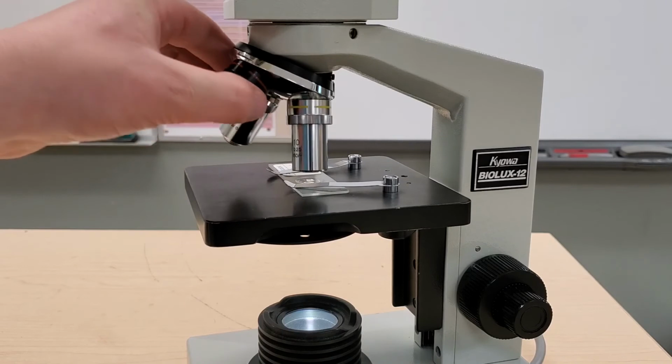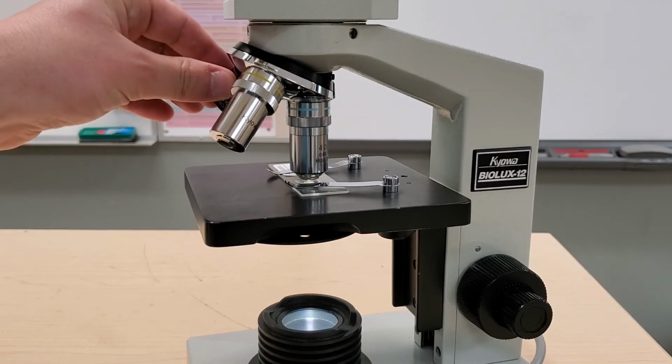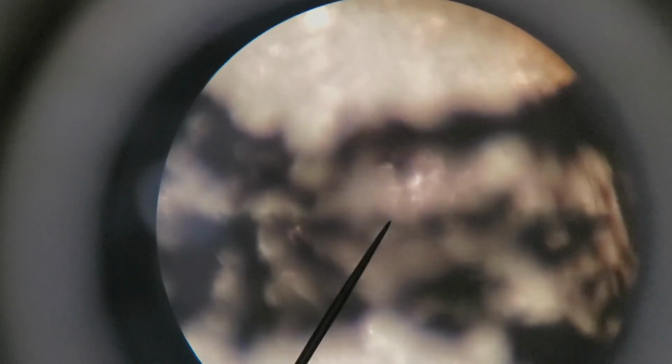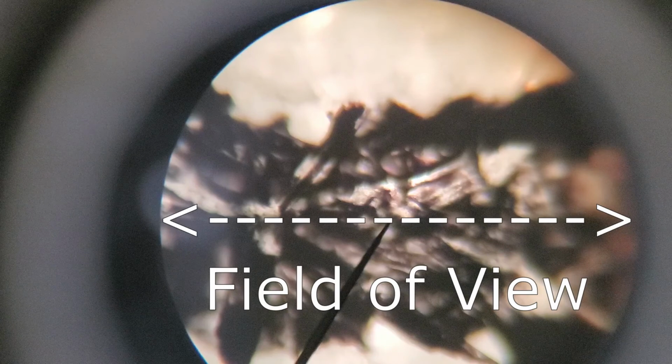If you need to, you can turn the revolving nose piece again to select high power or 40x objective lens. Again, you may need to change the focus of your sample only using the fine focus knob. Feel free to open the diaphragm to allow more light to hit your sample because higher magnification lenses collect less light, and therefore they make your field of view darker.